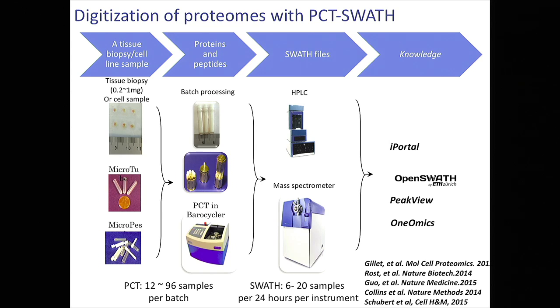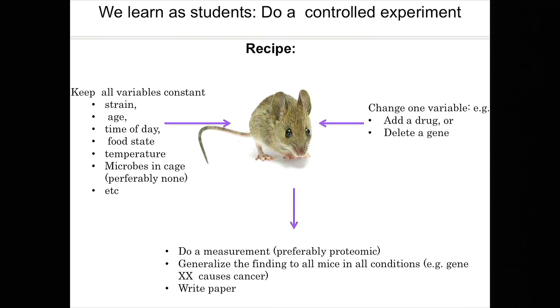We just think it's an advantageous instrument. And then we use a mass spectrometer. Typically, we use a triple-TOF mass spectrometer to generate SWATH data sets, or we use a Q-trap or a triple quadrupole instrument to generate SRM-based data sets. I don't need to explain more because everyone is very familiar with these techniques.